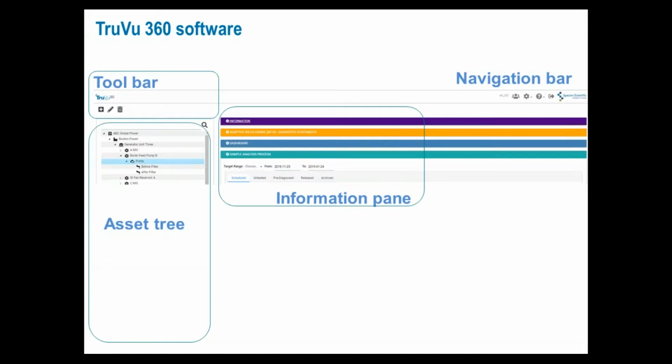I will switch to the software in a moment, and we'll start navigating these individual scenes and go from creating the sample to processing the sample and looking at the final report after making whatever edits we want to before releasing it is what the balance will consist of.